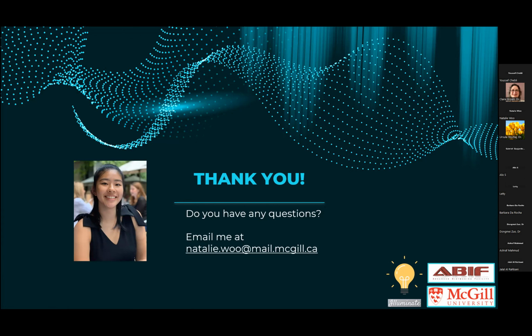No. So I'm not sure, but I could definitely get back to you. I think if you could embed them in the gel, I don't see why it might not work. Yeah, I don't know if it'd be an isotropic expansion though, if it's adhered. But that's a very good question. I will look into that.